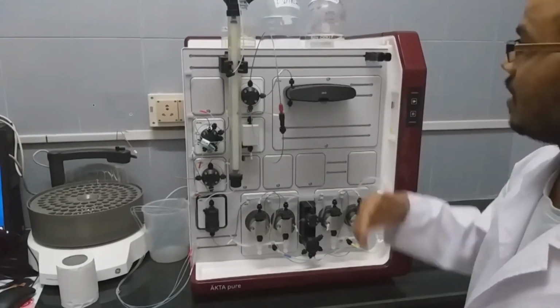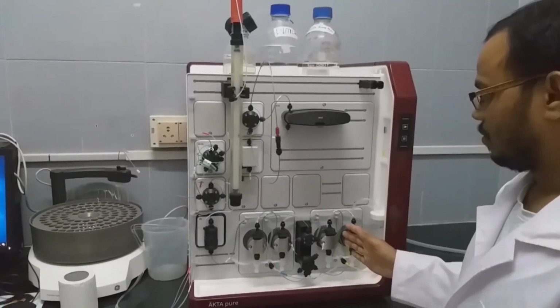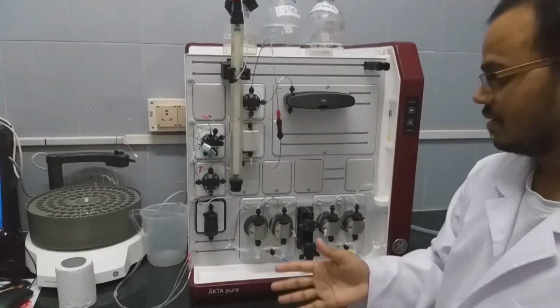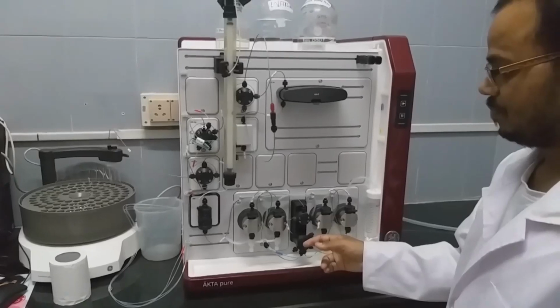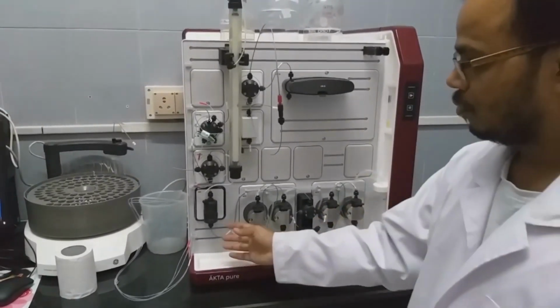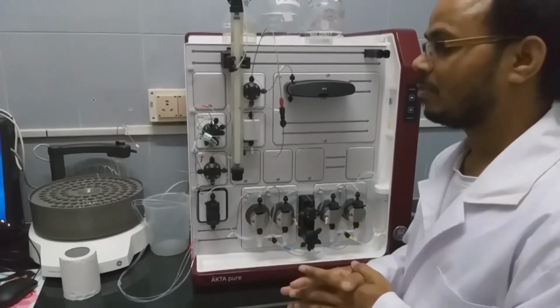Whatever buffers are coming from this buffer tray will enter here. These pumps, whatever pressure they are getting, can be regulated here. This is the pressure monitor. Once the pressure is monitored, it will go to the mixer. This is the mixer where two different buffers are mixed.